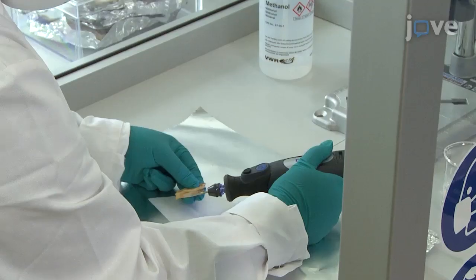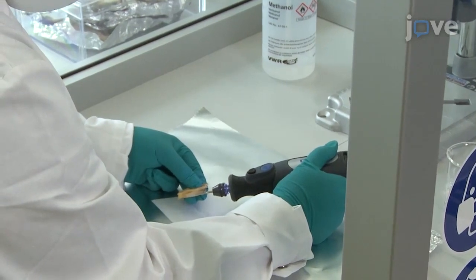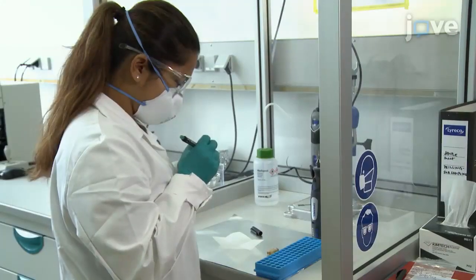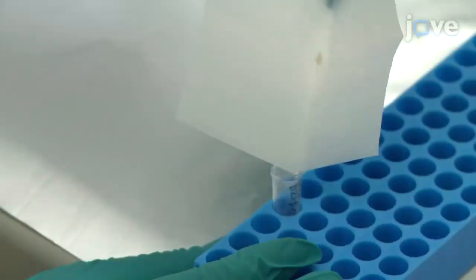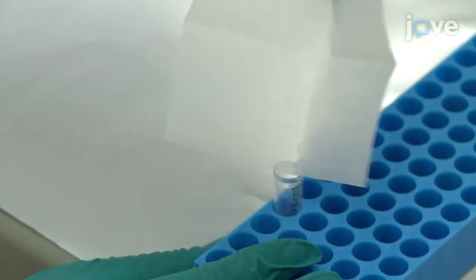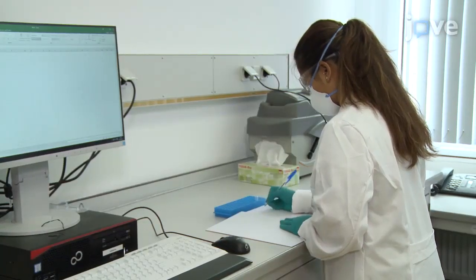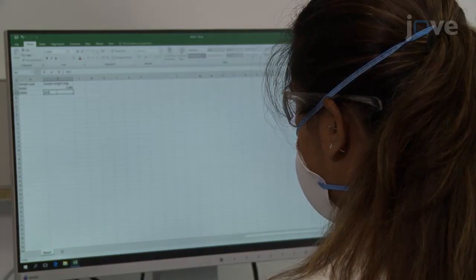Be aware that the amount of sample powder drilled will vary depending on the equipment used for analysis, the pretreatment protocol, and the size of the tooth. Collect the resulting enamel powder and transfer it into a 1.5-milliliter microcentrifuge tube. Record both the sample number and enamel weight in a laboratory notebook as well as an electronic database.